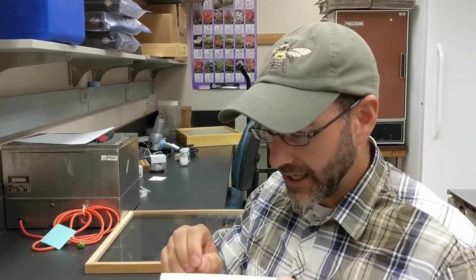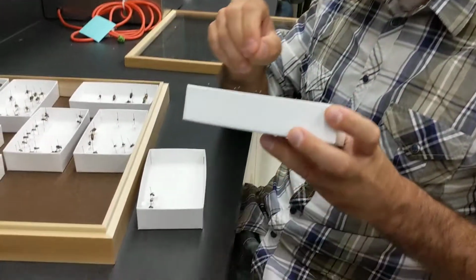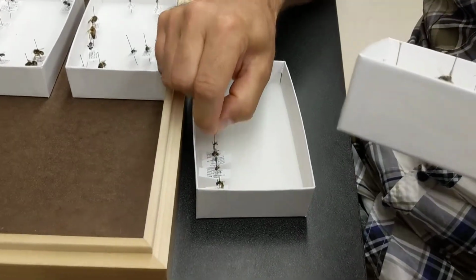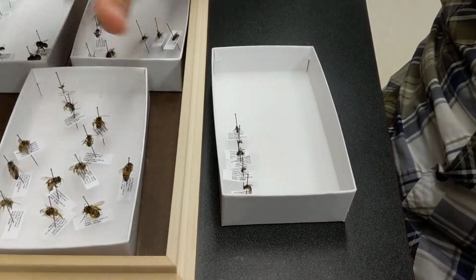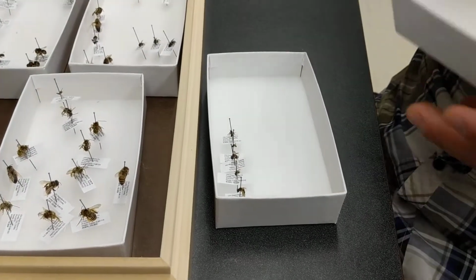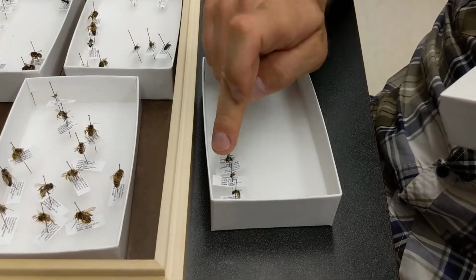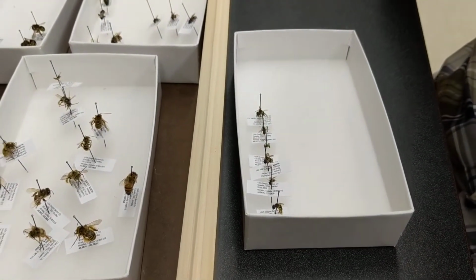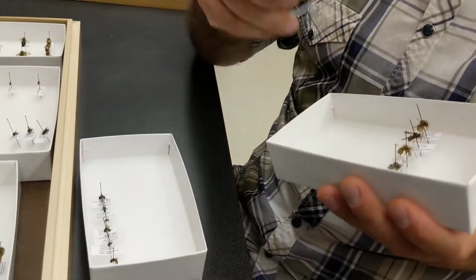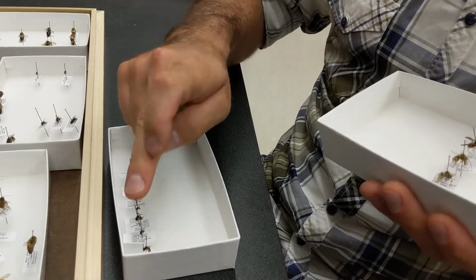And so the last thing I'm pulling out here is, these are all the Halictidae, so all the little sweat bees. Some are bigger, some are smaller. And these are all from the pollinator garden here at OSU. And so we have a lot of Halictus ligatus, which are the bigger ones. We have quite a few Halictus tripartitus, which are really abundant in the garden. So this is going to be a lot of these smaller ones.